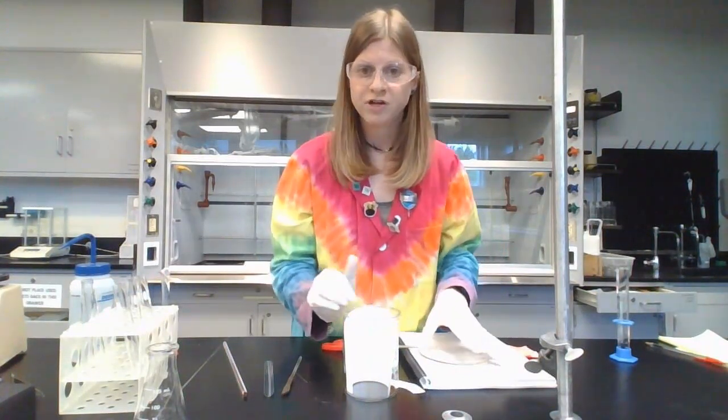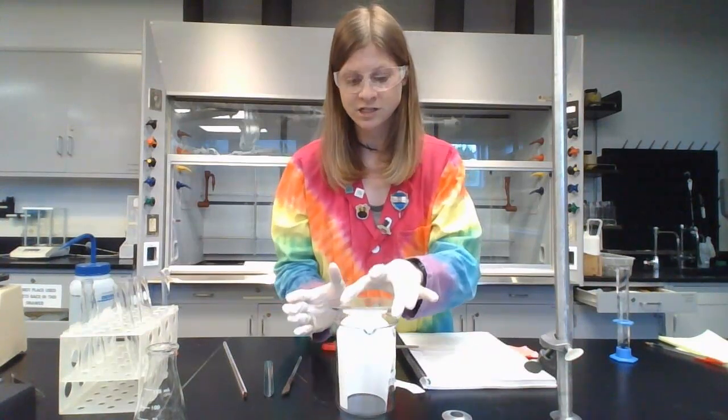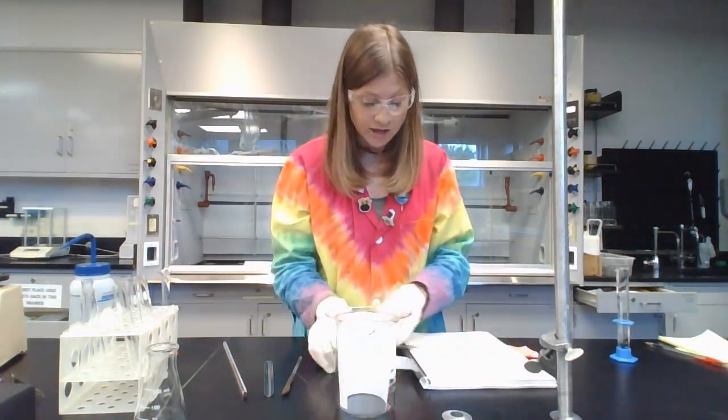There we go. So it fits perfectly inside of this. I don't know how well you can see. Okay, and so then the watch glass, its job is to be the lid. So that's our developing chamber.